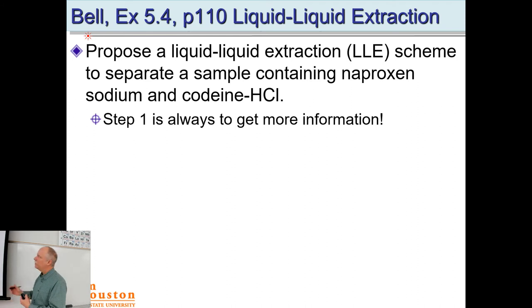And so then we talk about these different layers in contact with each other. And we can use that to separate substances. So let's look at this example. We propose a liquid-liquid extraction scheme, LLE, to separate a sample that contains naproxen sodium and codeine. And so step one is always to get more information.